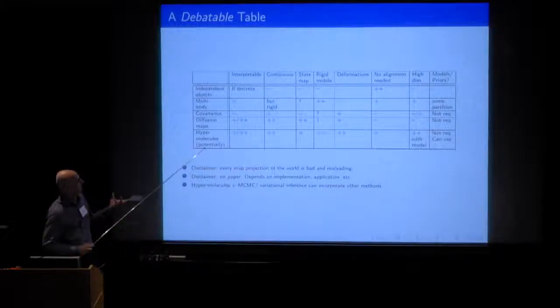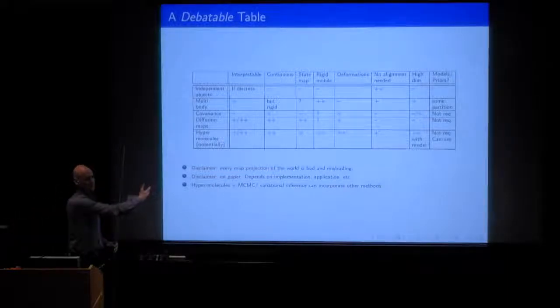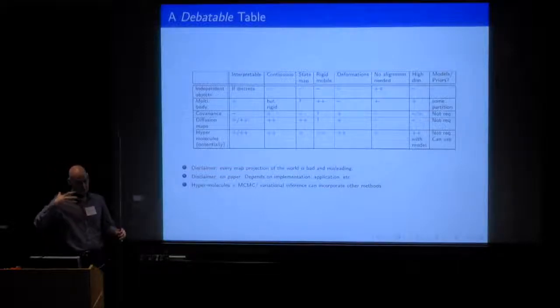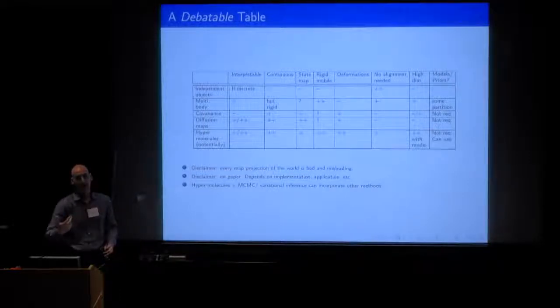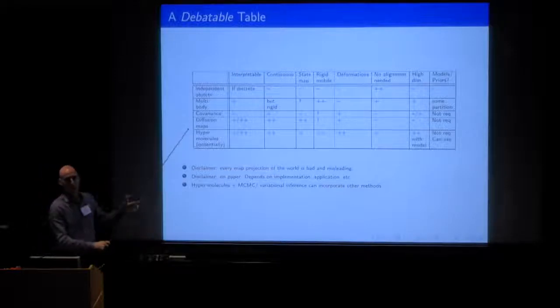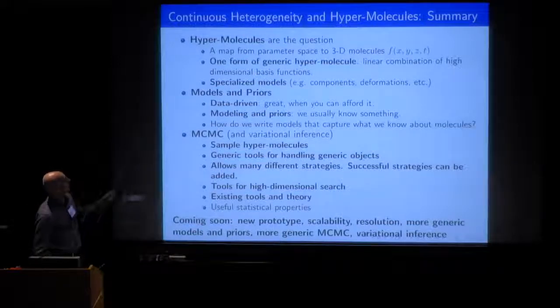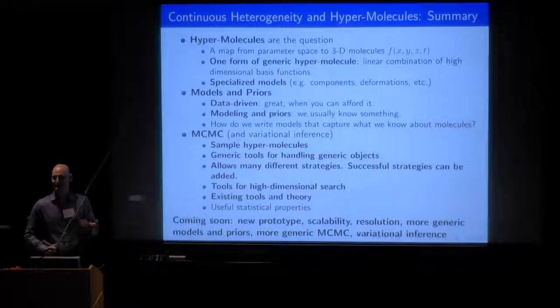And we think that we can get a lot of these things in these hypermolecules, partly because most of the great ideas can be translated into this domain. So if there are great ideas about using multiple objects and letting them move, why don't we let them move and also deform as they move? One of the nice things about this is that you can adopt things from other methods that really work.